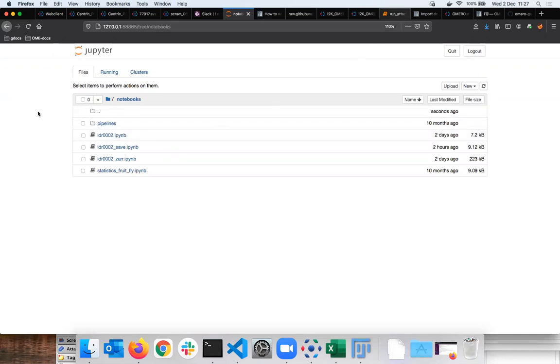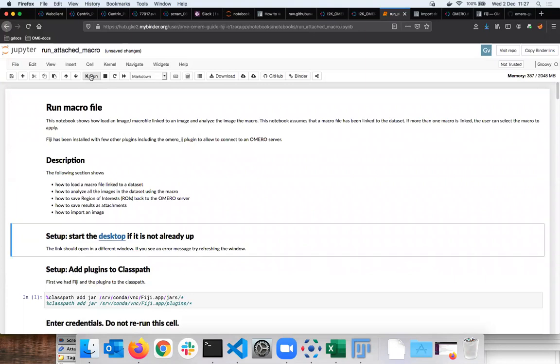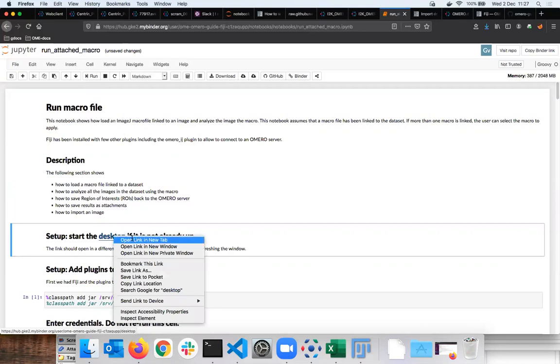I would go now back to this tab, where my Fiji is already built, so I can show what I was building for so long in my Binder on the cloud. I just started a small machine where there is Fiji wrapped with that, and once I did it, it took a small while, but after that I have it for free, if I start this desktop.